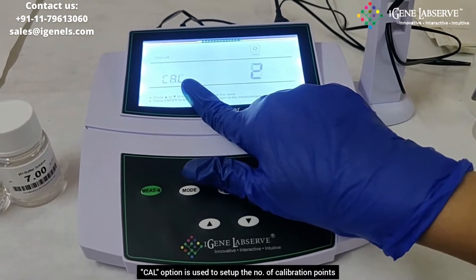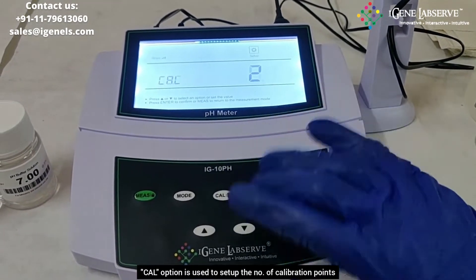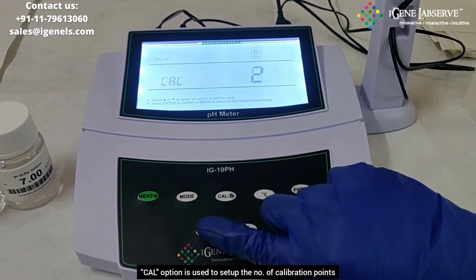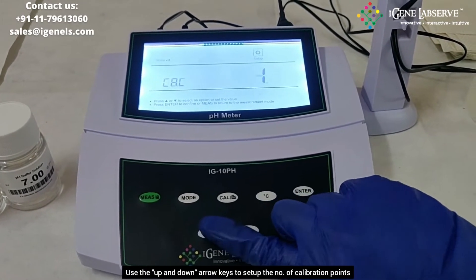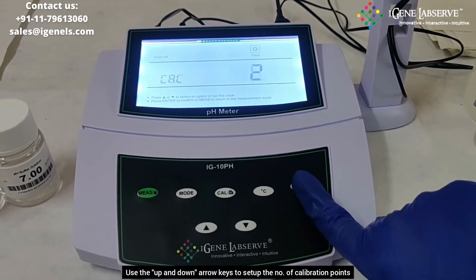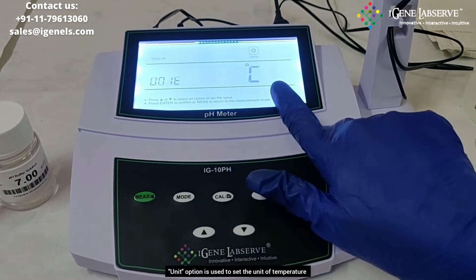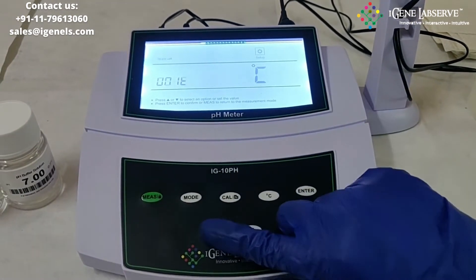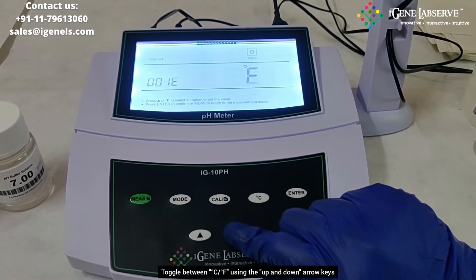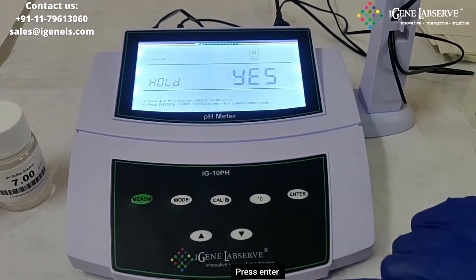It then goes to calibration, where you can set up the number of calibration points — that is, the number of buffers you are using for calibration. You can use the up and down arrow keys to toggle and select, then press enter. It goes to the unit setting, where you can select between degree Celsius and degree Fahrenheit, then press enter.